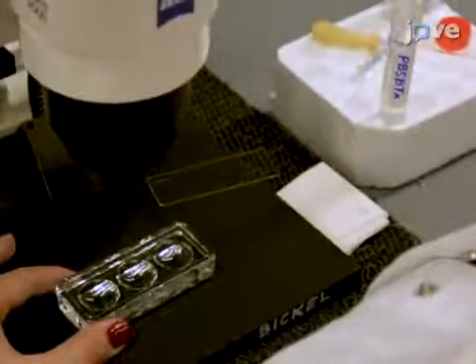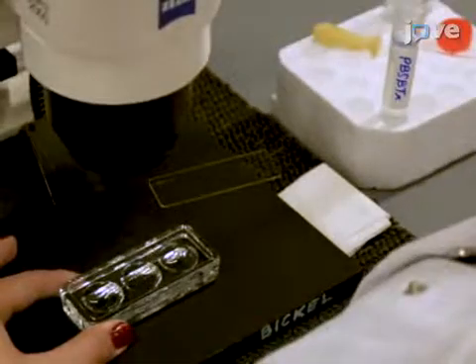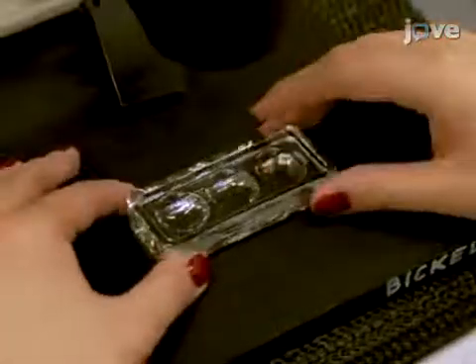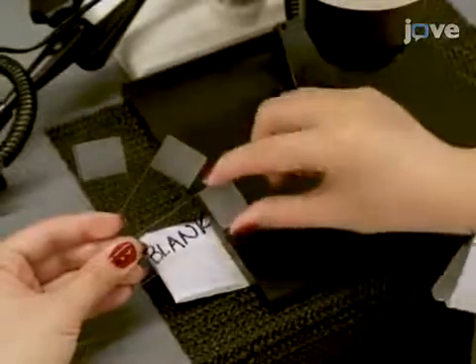To prepare for oocyte rolling, pre-wet a deep well dish with 200 µL of PBSBTX. Cover the dish and set it aside. Obtain 3 frosted glass slides and set slide 3 aside.